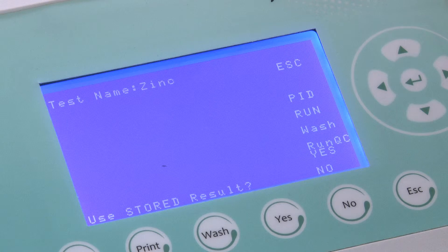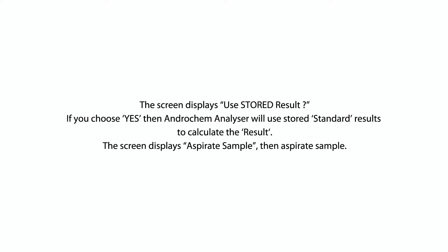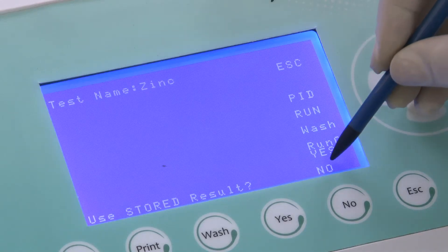The screen displays Use stored results, Yes or No. Choose No.